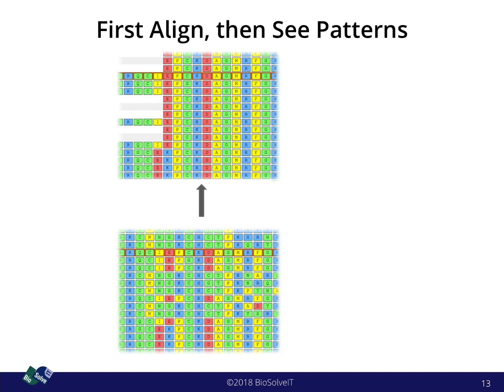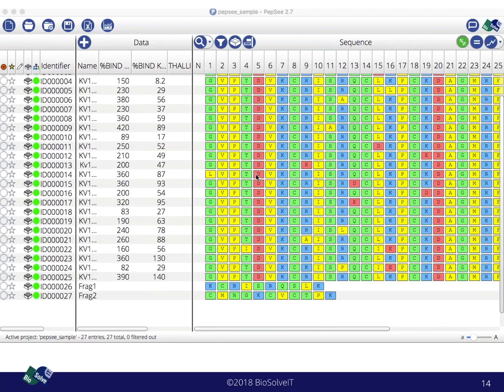Let me show you how this works. So in here, that's where we were before.